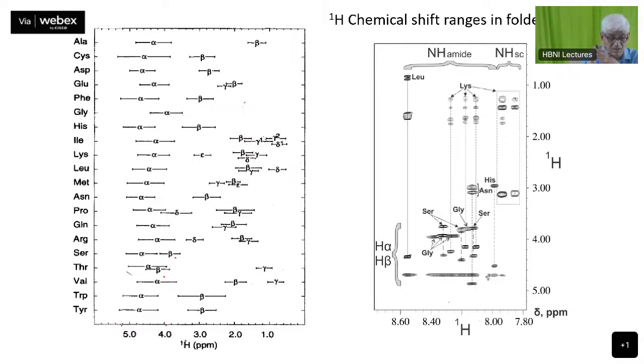These betas are the aromatic betas. Aromatic ring protons create a kind of ring current, as a result of which these beta protons are shifted quite downfield compared to these beta protons, these aliphatic protons. The beta protons of these aromatic ones appear around the 2.5 to 3.5 ppm area. In this area, there are also some other protons, the delta proton of the arginine. Delta proton, why is it here? Because it is attached to a nitrogen.